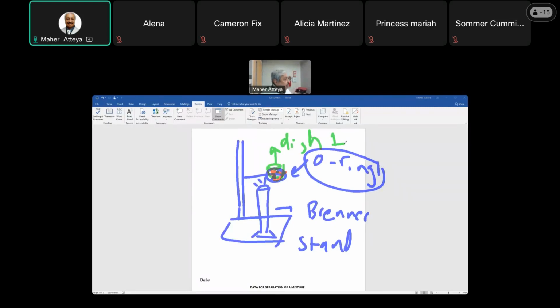First, we have to get rid of what? Of ammonium chloride. Ammonium chloride sublimes, that's the first one we have to get rid of. We separate ammonium chloride by heating slowly first, and then a little bit vigorously, but not too much heat, just enough to drive all the smoke out. You will see ammonium chloride going out as a big smoke. Are you following me here? So you heat until the smoke stops, then that will tell you that ammonium chloride is driven out, is sublimed out of your mixture. There's no ammonium chloride inside your mixture, correct?